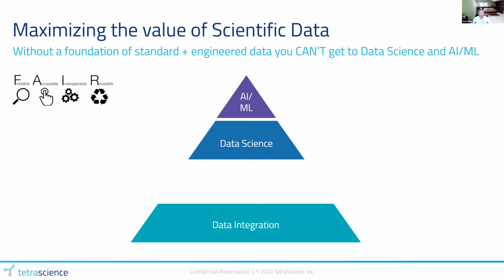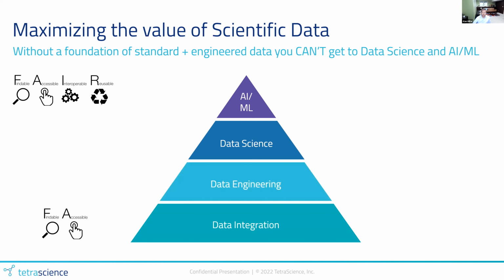But that's really based on a foundation of integrations, we think: the ability to connect to those assets in the laboratory that produce the scientific data, which makes it, of course, findable and accessible. And also that data being engineered into a format which is compatible with the end use cases. And again, go back to, we have so many different analytical testing methodologies in the lab. Typically, they all come with their own vendor-specific data format.